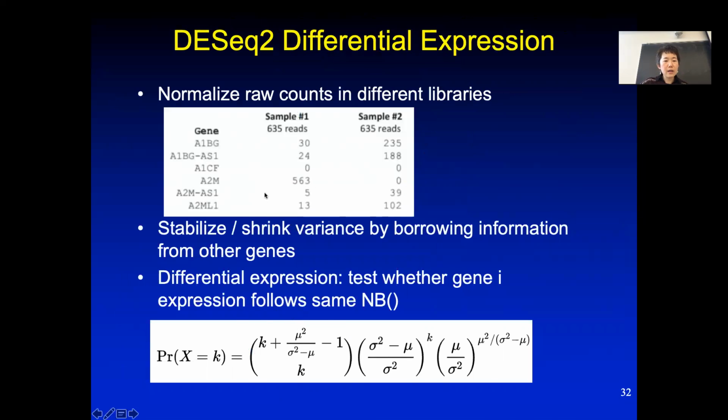So we want to mention also very quickly how to do the normalization. This is something also kind of interesting that DESeq considers. So initially, remember, we want to use the raw read count in the differential expression calculation, but we want to normalize it just a little bit. We don't want to normalize it all the way to the RPKM or TPM level. However, there's another small scaling factor.